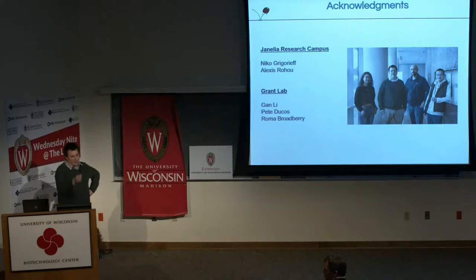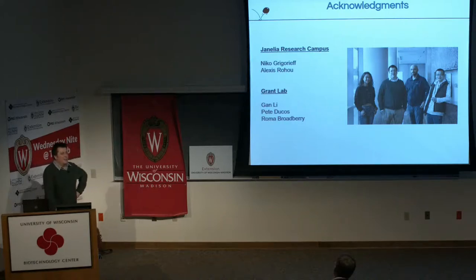Anyone else? Owen. Excuse me if I'm just not quite understanding the math, and I'm sure people have thought extensively about this, but it seems like a lot of the basis for this data analysis is based on spherical or globular proteins. You're even talking about starting off with a spherical blob to then get an ab initio structure that you'll use for particle matching. So what happens when you aren't really dealing with globular proteins and perhaps have extended structures?